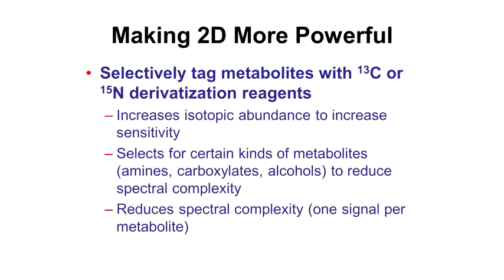So we've hinted at some of the ways of getting around this. We've talked about things like ultra-fast spectroscopy, which can accelerate the time. But there are also other elegant ones which use tagging. I mentioned the tagging approach in DNP, but you can use tagging without DNP. And this is something that Dan Raftery has been doing for a number of years.